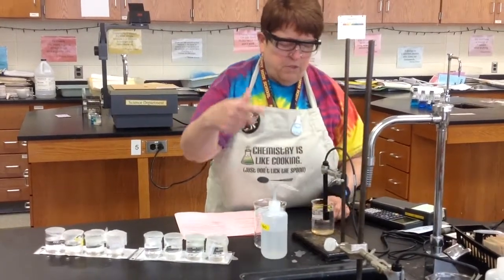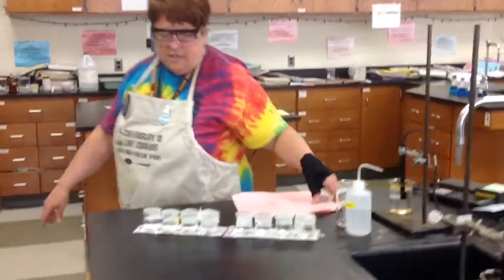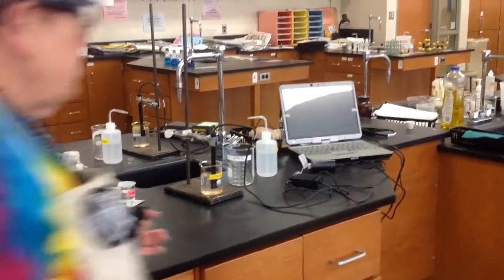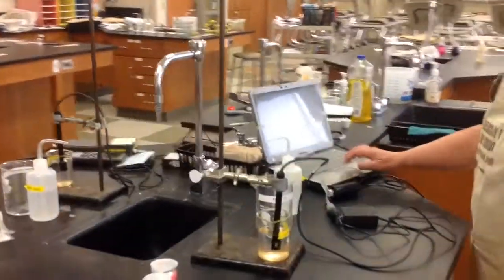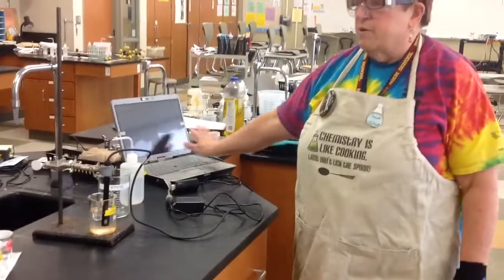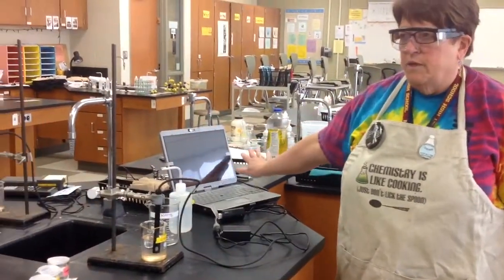The only difference between these two sides is this side has a computer instead of the calculator, and you will just get the reading once this is on. It'll just be right on the screen here, the reading that you need. Please keep the chemicals away from the computer. Keep everything to that end.